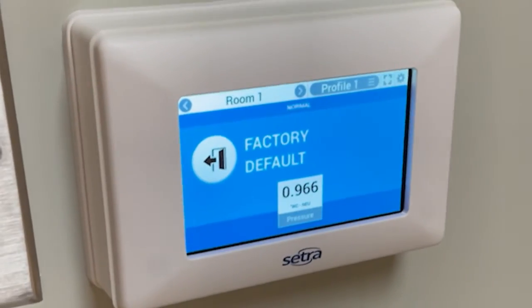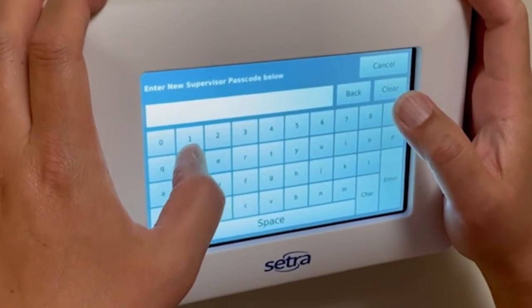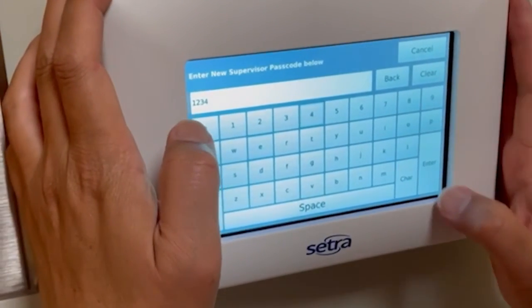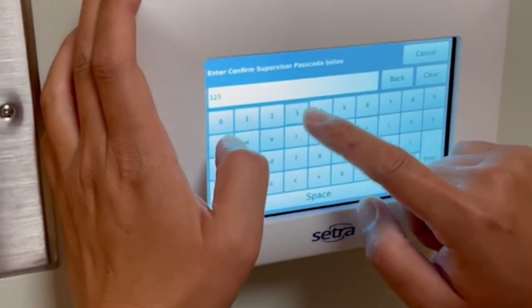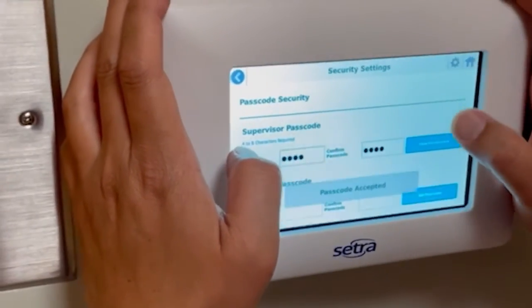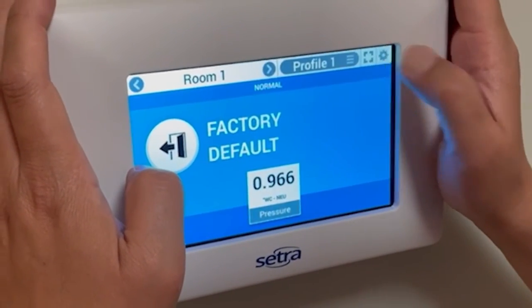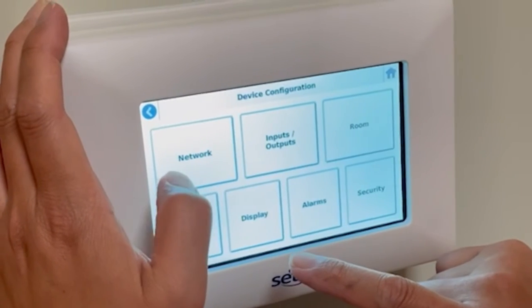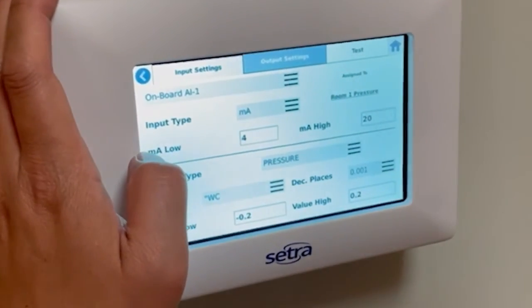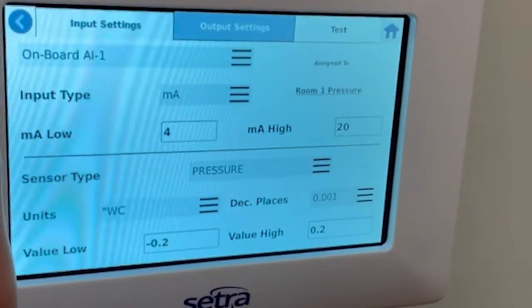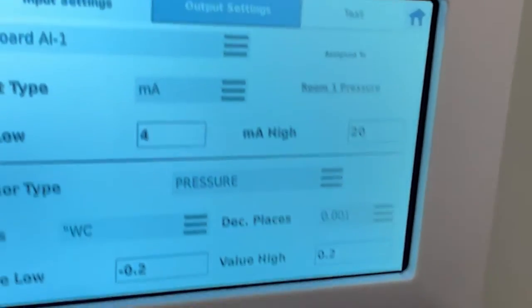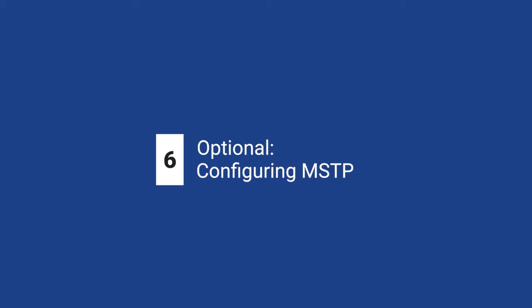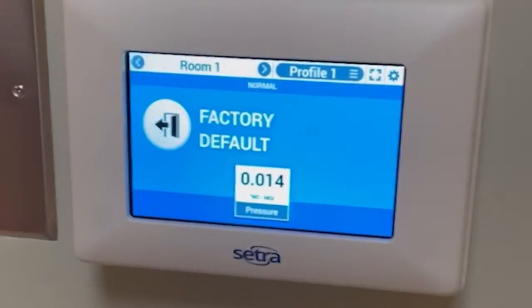The next step is to set up and configure the monitor. Initially you'll be asked to enter a supervisor passcode for the first time. At this site they want to use 1234. We're just going to put in a supervisor password for now and start with our setup. First go to device configuration, inputs and outputs. We're going to verify that our transducer is set up correctly. Since this kit is intended for this, it should be pre-set up as you see here.